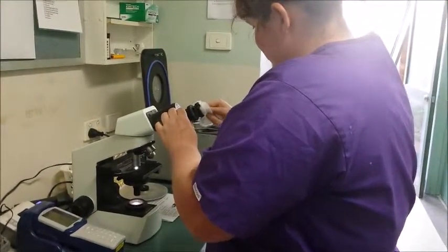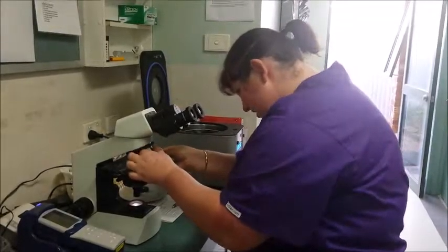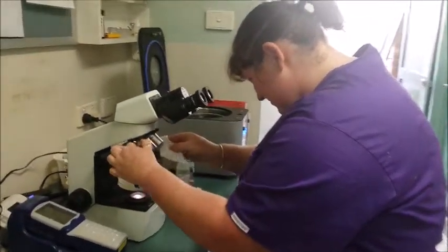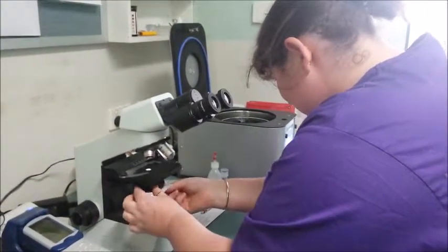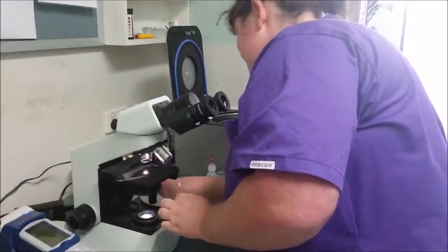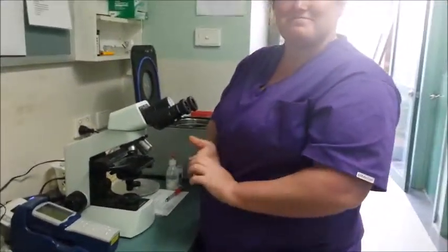Wipe down your eyepieces, each lens, and wipe down anywhere you've touched. And turn the microscope off. Thank you.